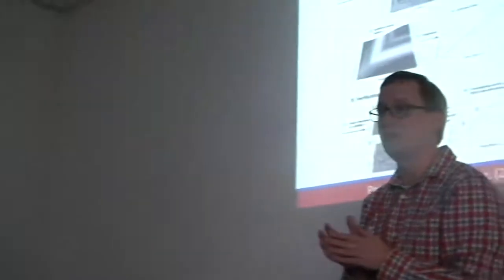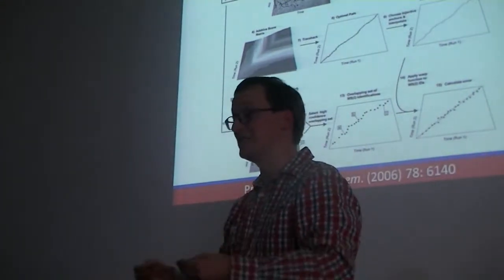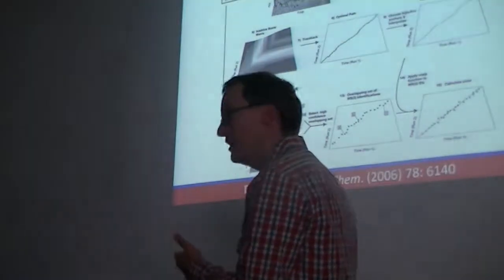I do not expect to ask you how retention time alignment works in this, but I do expect you to know that it exists and that it's one of the main reasons people would use XCMS.